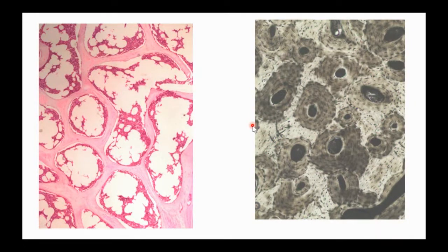Compact bone tissue is probably like the most recognizable tissue we're going to look at ever. So I hope we all get really good at identifying compact bone tissue. Let's start with that one over here. When you look at compact bone tissue, you're going to see these big tree ring patterns. These tree ring patterns are where we find the cells arranged in bone tissue. Kaylin's totally right. The cells inside this tissue are the small black dots that you see everywhere. They're called osteocytes. Osteocytes, that's my word for bone cells.